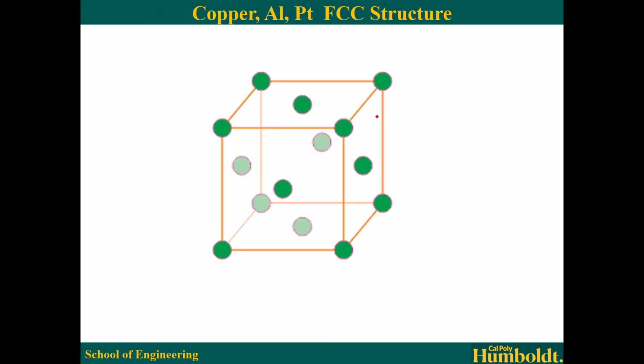So we have several candidate materials that we are going to investigate in this lab. Copper, aluminum, platinum.